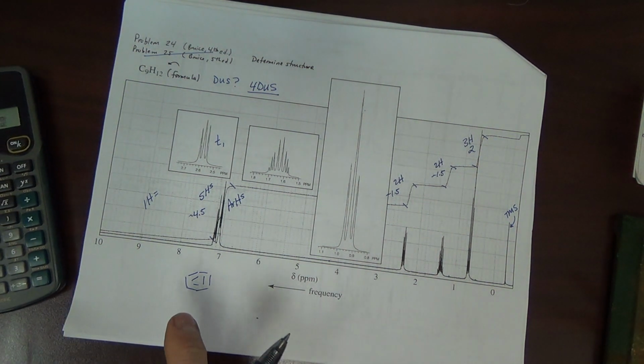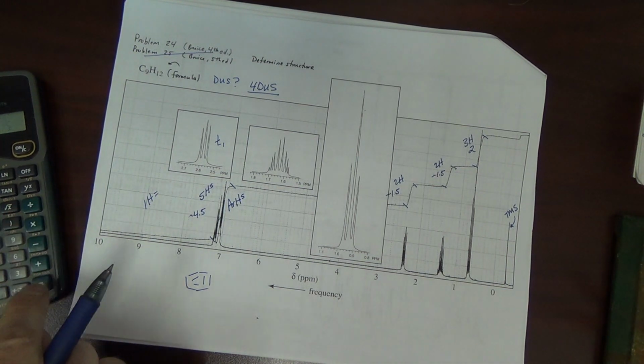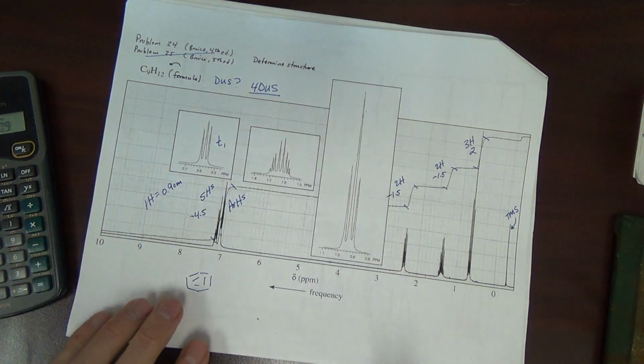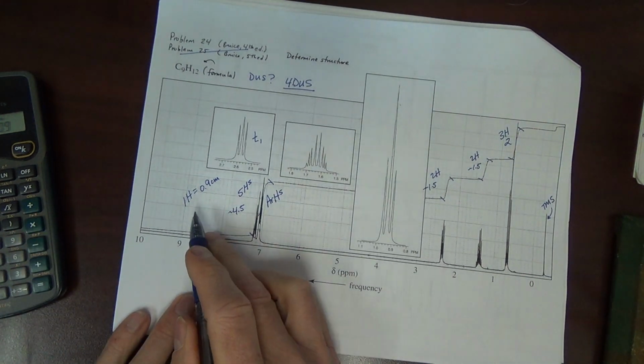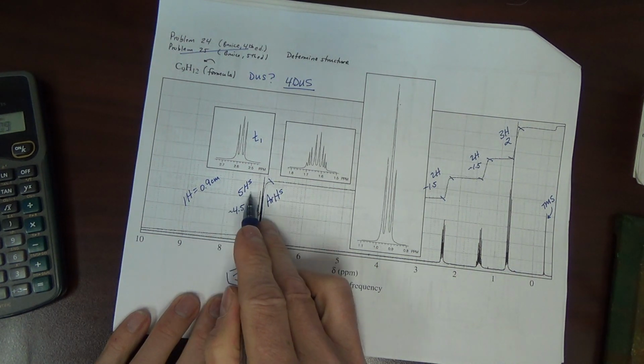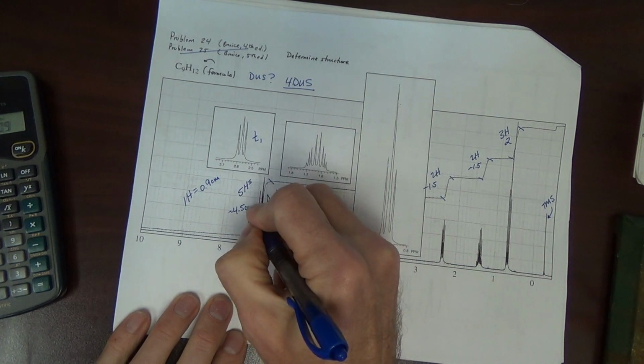That is 4.5 divided by 5 equals, this looks like each H is 0.9 centimeter. 5 H's would be 0.9 times 5, 4.5 centimeters.